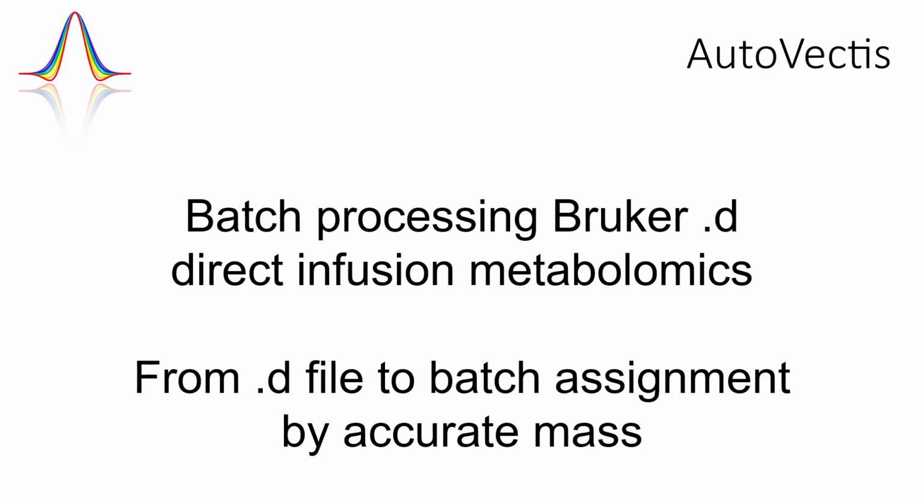Hi, in this video I'll be giving a demonstration of processing a large batch of direct infusion metabolomics data using AutoVectis. We'll start with a folder full of Bruker files and end up with each one of those assigned and a database combining all the results into one file.